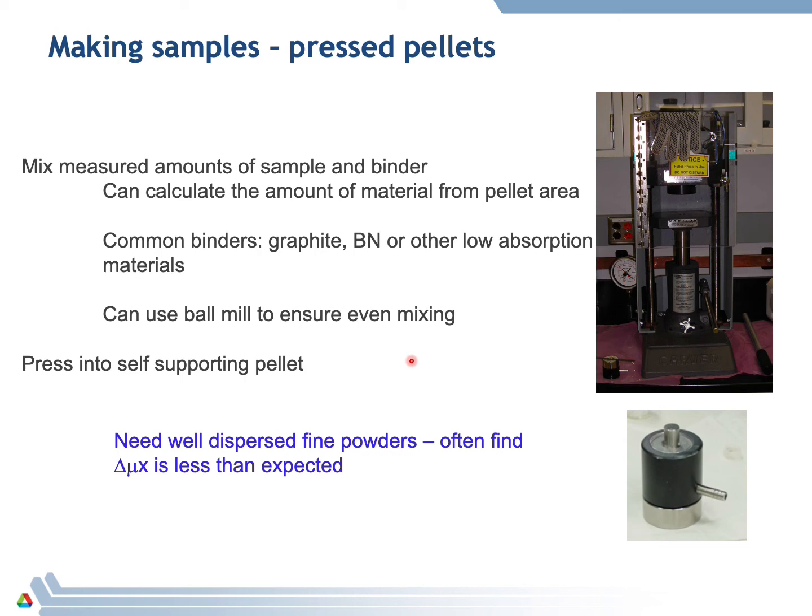Again, though, you have to remember, just because you have the right weight, you still need very fine particles, powders. If you have a mix of fine particles and larger particles, say you use the 400 mesh, there might be some particles that are 20 or 30 microns thick. When you put them in the beam, very little of the beam is going to make it through those particles, but they'll incorporate a large fraction of the weight of the sample because they're large particles.